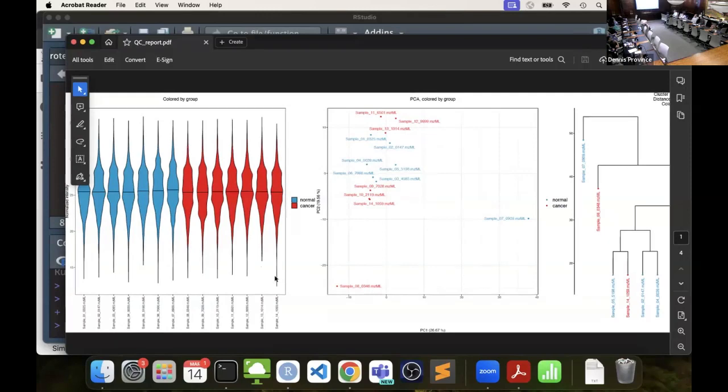So sometimes there can be a really big density of missing values for DDA projects where we did gels or just injecting samples independently. We get a lot more here. So we still have projects that are label free and without the DIA approach. And those will include a lot more missing values. And so there's more you've got to deal with on missing values.